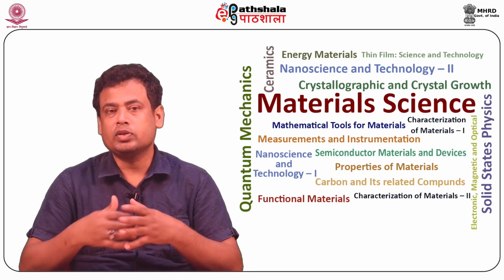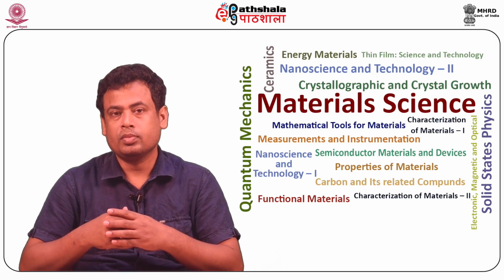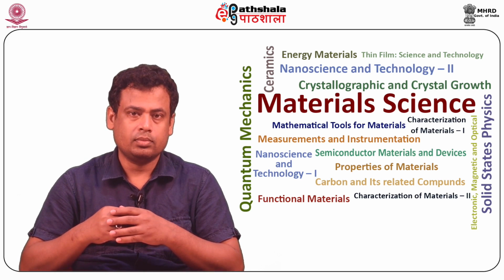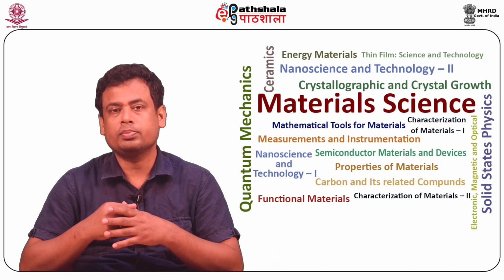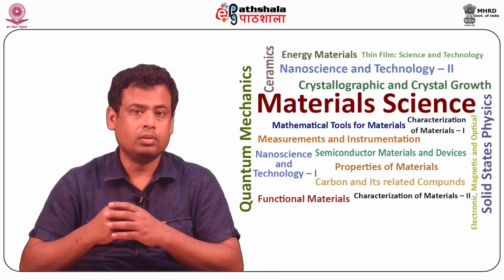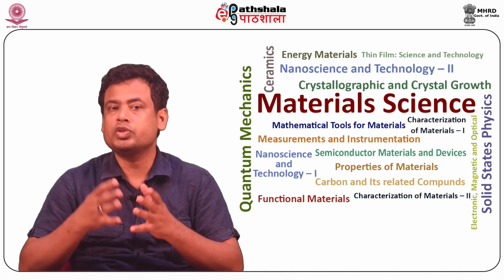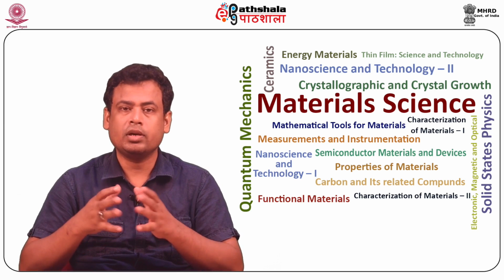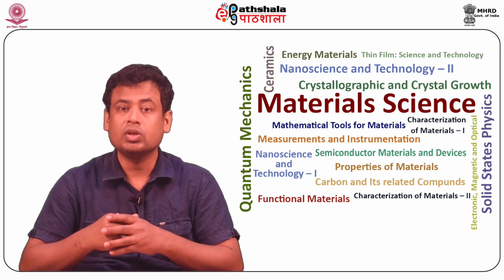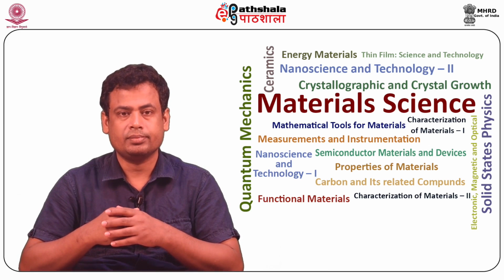Let us discuss the issues with signal collection in low voltage SEM. In most SEMs, the secondary electrons produced by collision between the beam electrons and the sample are collected by a field imposed at about 300 volt to attract electrons at the entrance of the scintillator or photomultiplier signal amplifier.